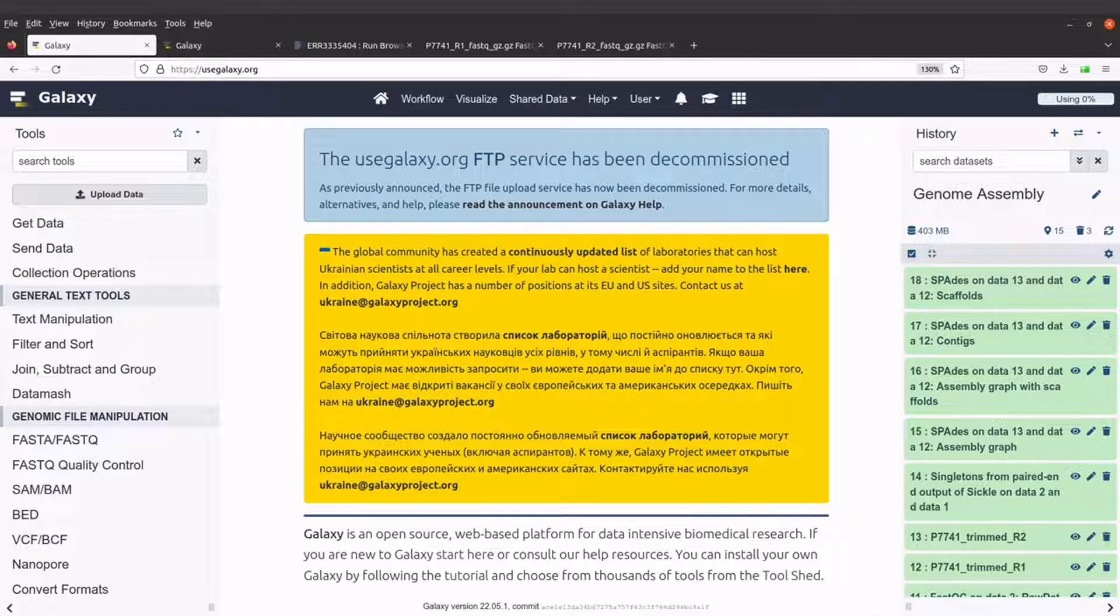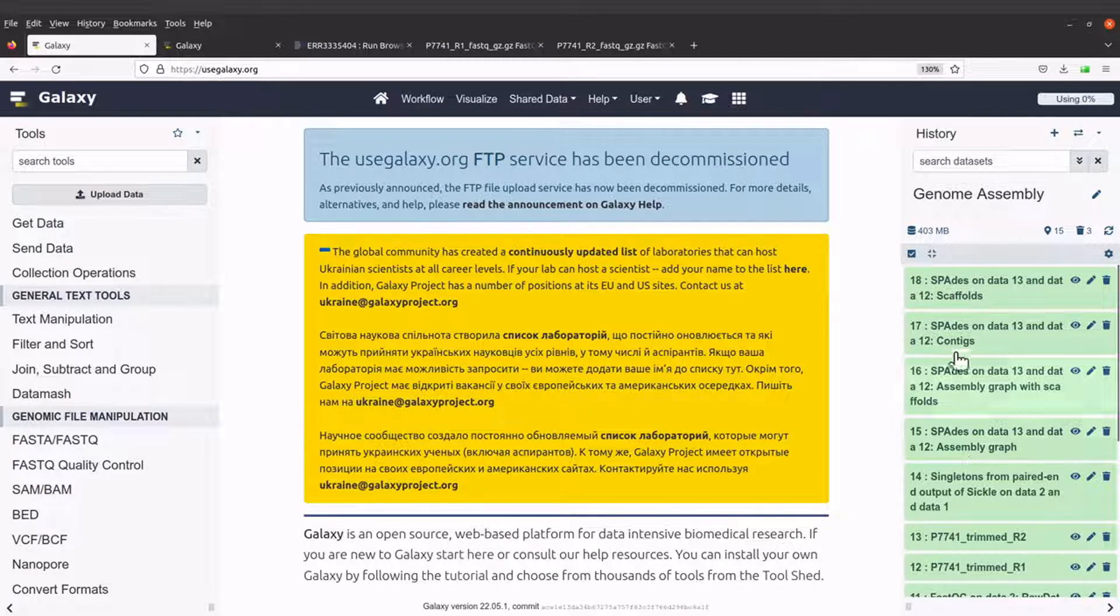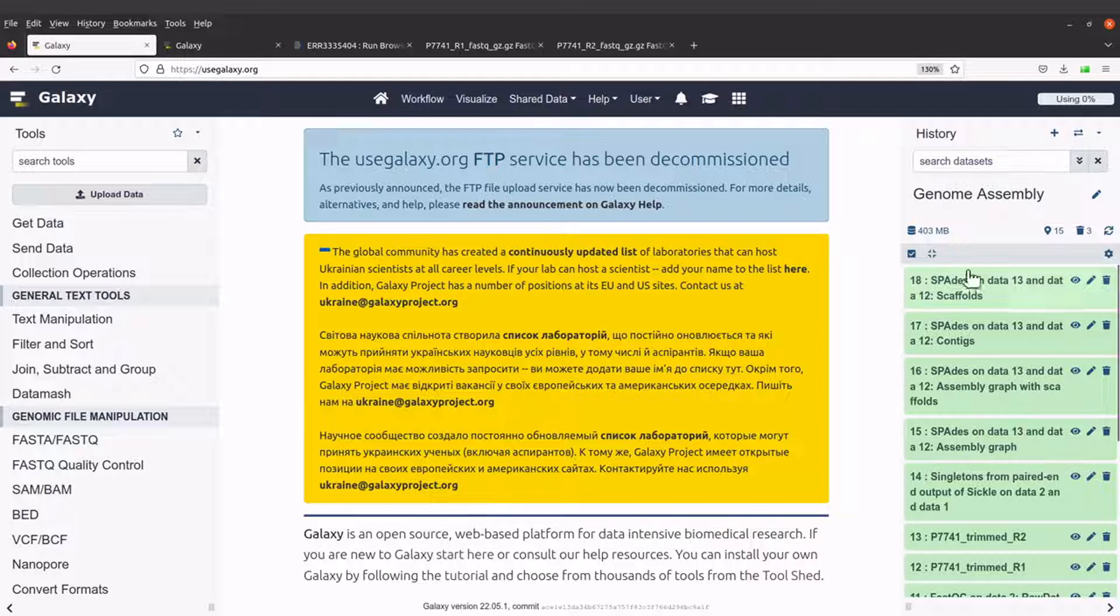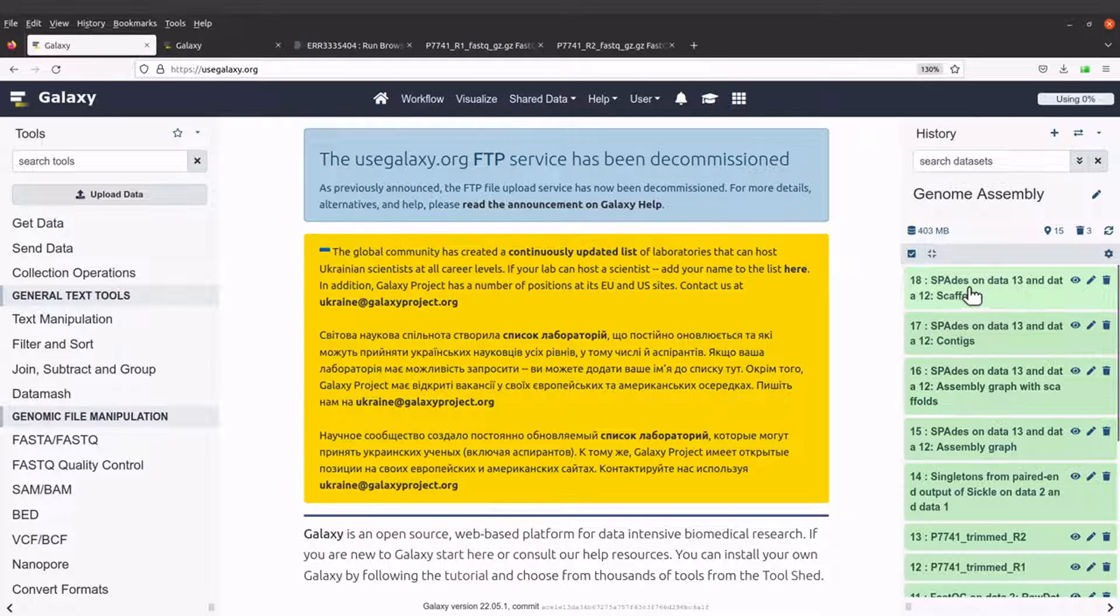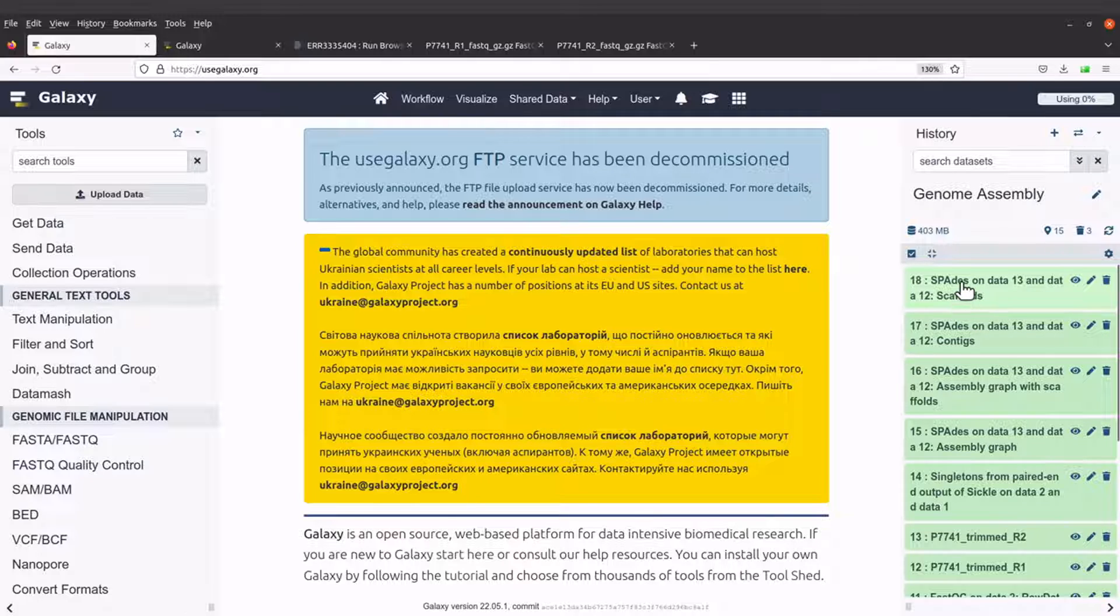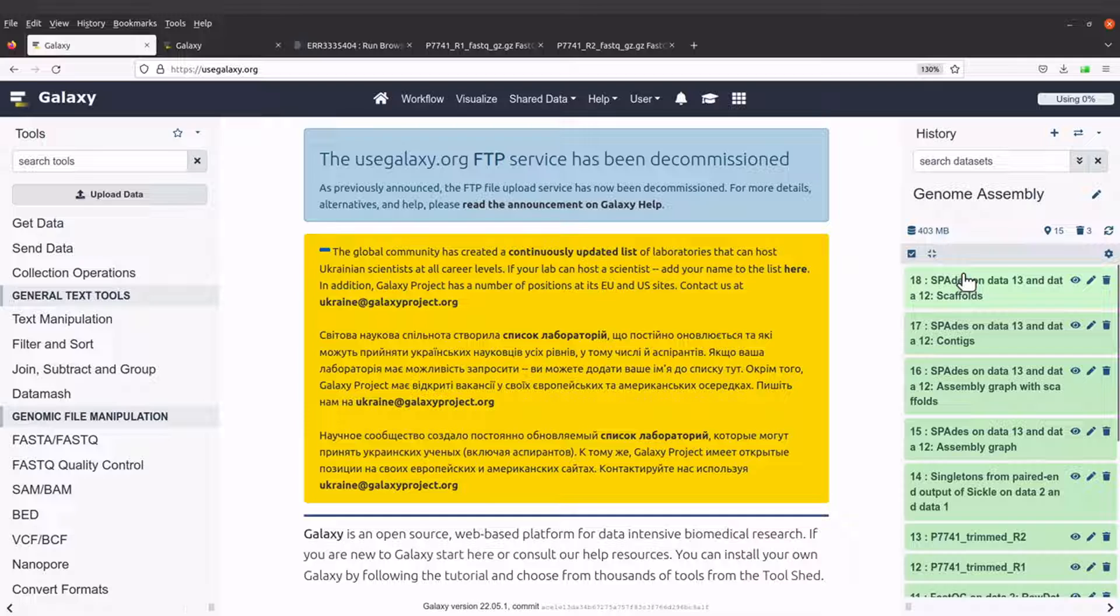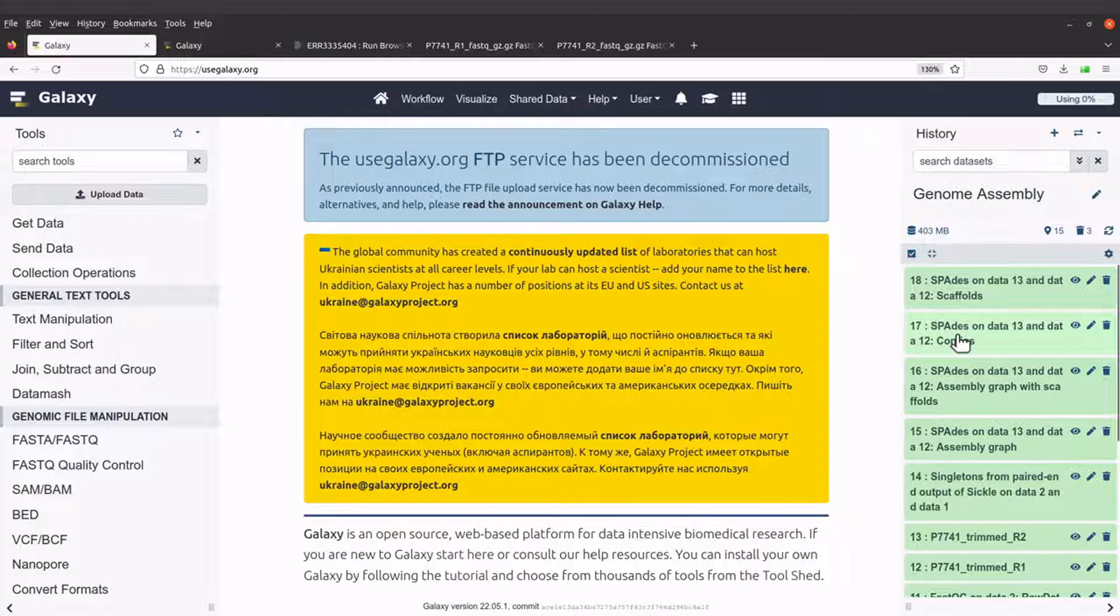Genome assembly has been done, and that is why the backgrounds of these four files are now green. From the parameters that we selected, four files have been generated.